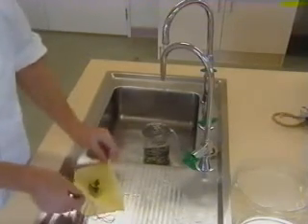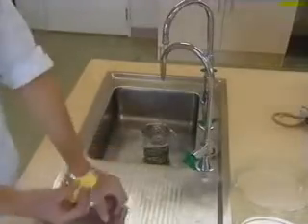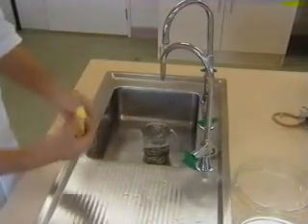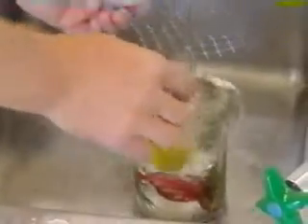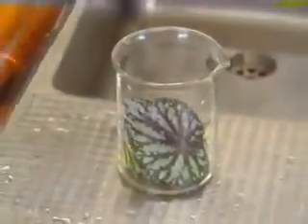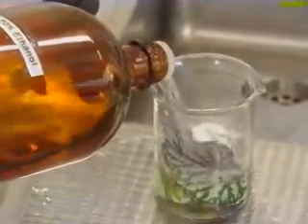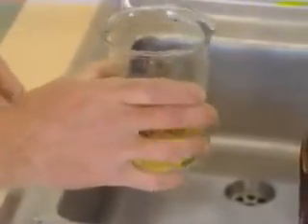If the pieces of plant material used are small, wrapping them in a piece of gauze or cheesecloth will hold the material intact during the sterilization. Then, the plant material is rinsed in 70% alcohol for 10 to 30 seconds. Alcohol not only kills many microorganisms residing on the surface of the leaves or buds, it also acts as a surfactant.